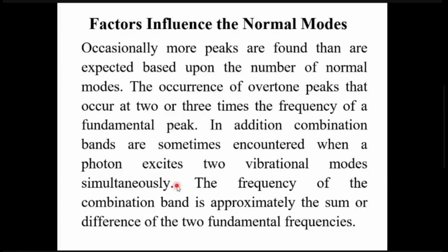This we saw in the previous slide also, that there are two vibrational modes having exactly the same energy. So if a photon impacts the molecule carrying twice the energy of the individual modes of vibration, then both the vibrating bonds will absorb that photon and share the energy. Although we do not have any theoretical basis for that higher energy, still that energy is absorbed by the molecule.